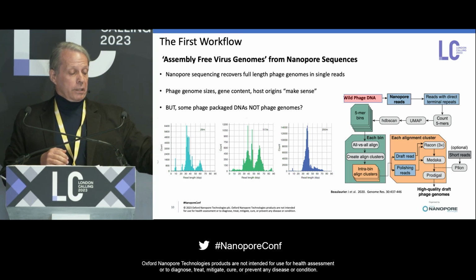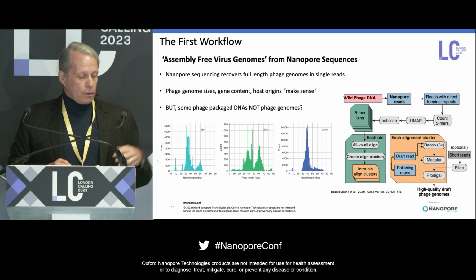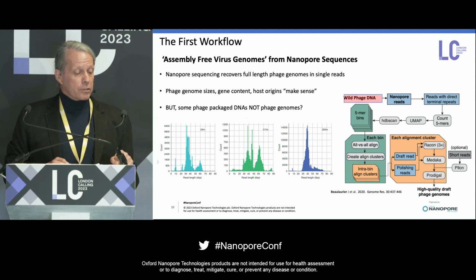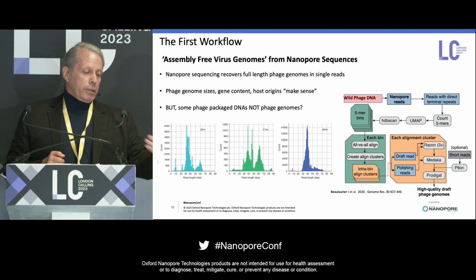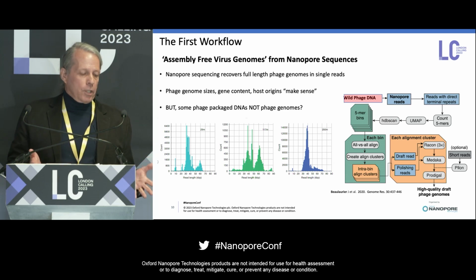You see basically the sizes of genomes from different depths in ocean waters out where we work, north of Hawaii, from the surface or near surface 25 meters, 117 meters, and 250 meters. So we get intact viral genomes, and John Bollier established this first workflow where we could identify those phage and then start to sequence them.